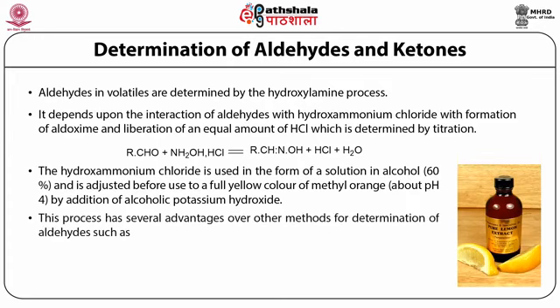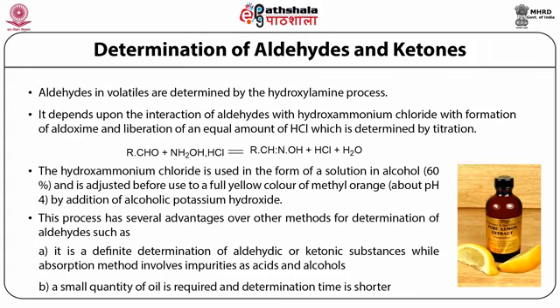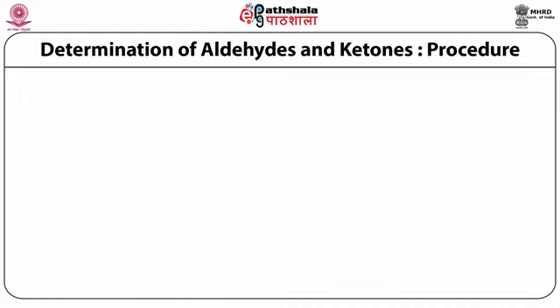This process offers several advantages, in that it is a definite determination of aldehydic or ketonic substance, and it also needs a very small quantity of oil for determination. The determination time is also very short. The procedure for the determination of aldehydes goes like this.